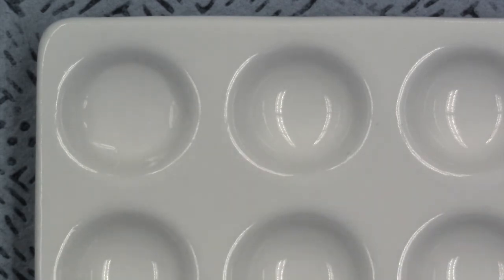This was the starch treated with water and heat. And we're going to treat it with an iodine solution. Now this iodine solution will turn black in the presence of starch. Here's what the solution looks like on its own. It's kind of a yellow color. Okay? So that's the solution on its own.